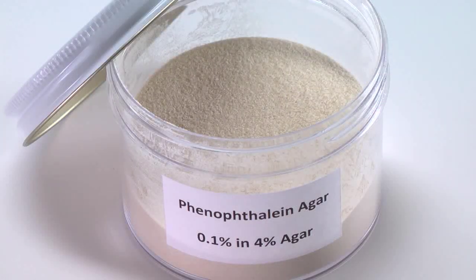Variations of cell model size and shape can be accomplished with the phenolphthalein agar included in the inquiry toolbox. Simply rehydrate the agar powder to a final concentration of 4% in 2.5 liters of water. The agar is then melted and poured into shapes and sizes according to student experiment design.